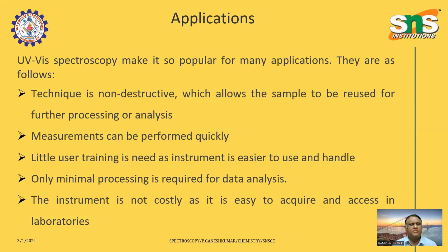The measurement can be performed quickly. Within 5 minutes, we can finish the measurements. Little training is enough to handle the instrument, no special skill is required, and there is very minimal processing in the data analysis. The instrument is not a costly one, so even many industries or institutes can afford it.